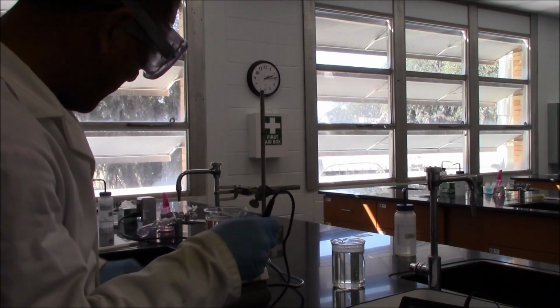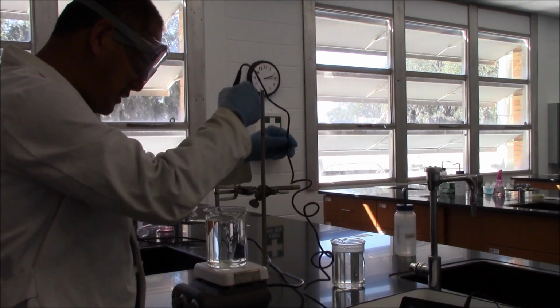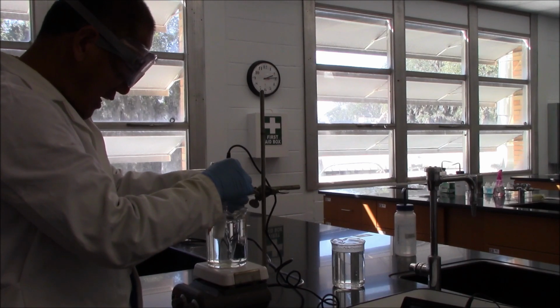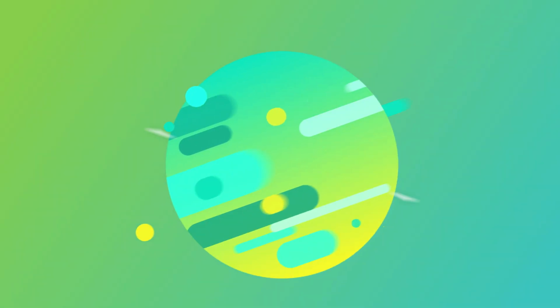The next step is we will repeat the same procedure for the benzoic acid, lauric acid mixture. I'm not going to show it here because the steps are exactly the same.